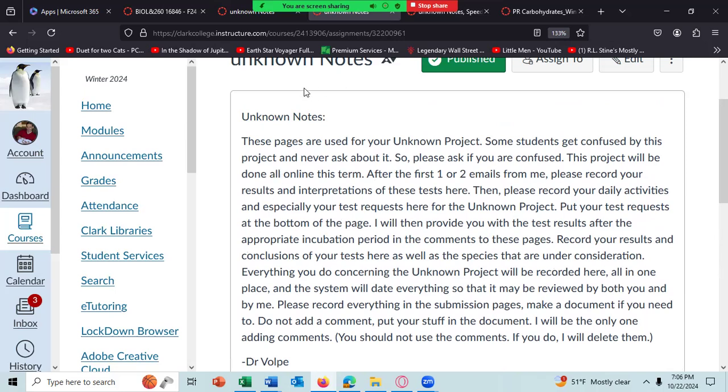All right, we talked about the species, how we're going to do it, and I'll send you a number. It'll represent the species. There's no way for you to know what species it'll be from the number. The only way you'll be able to figure it out is by running different tests.